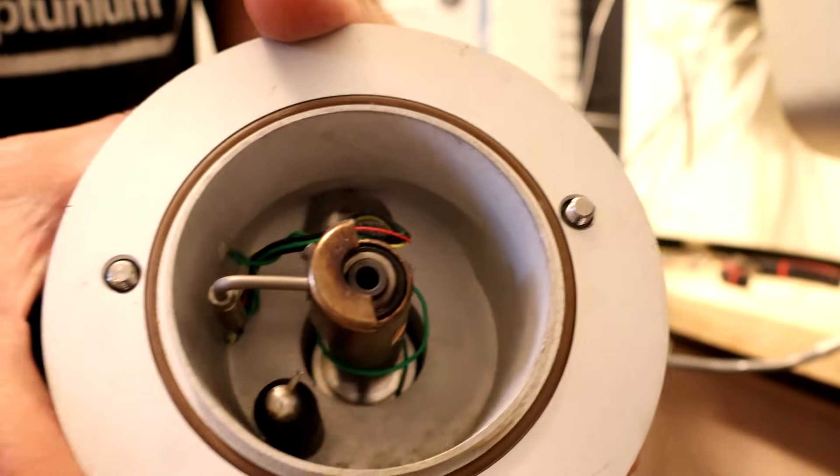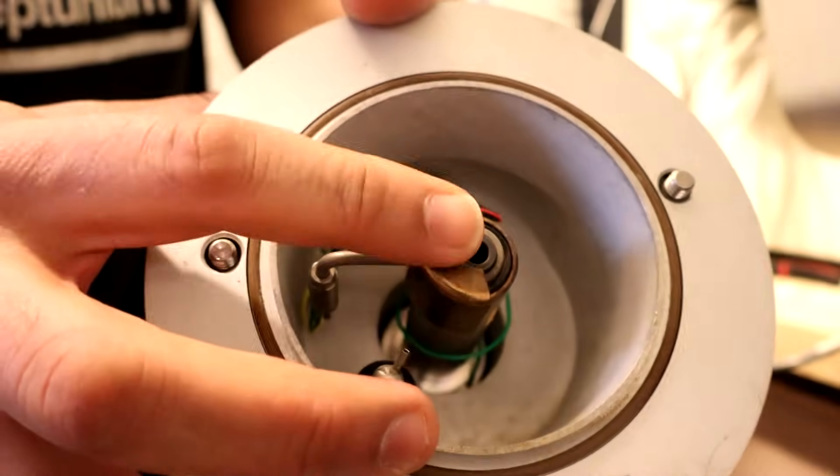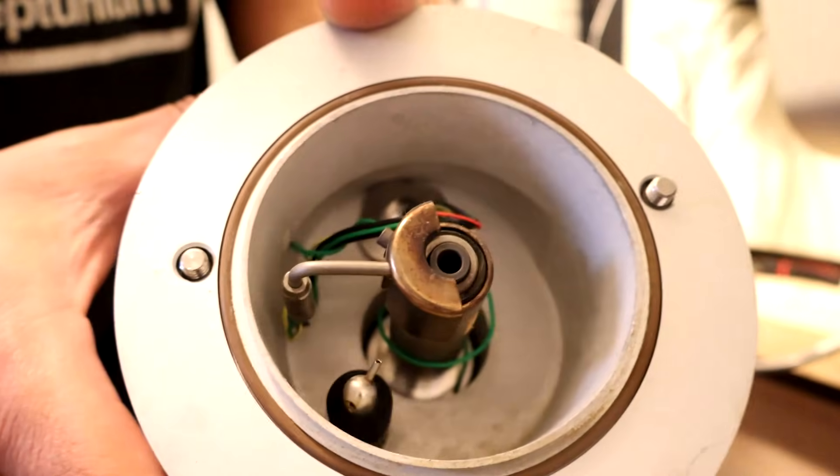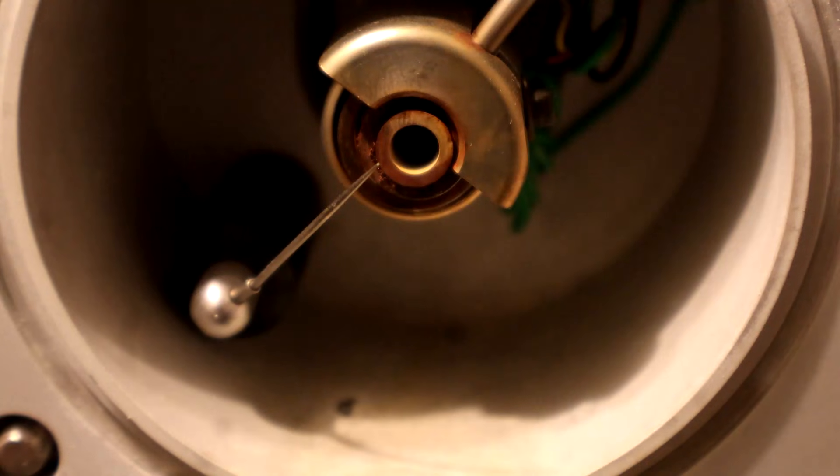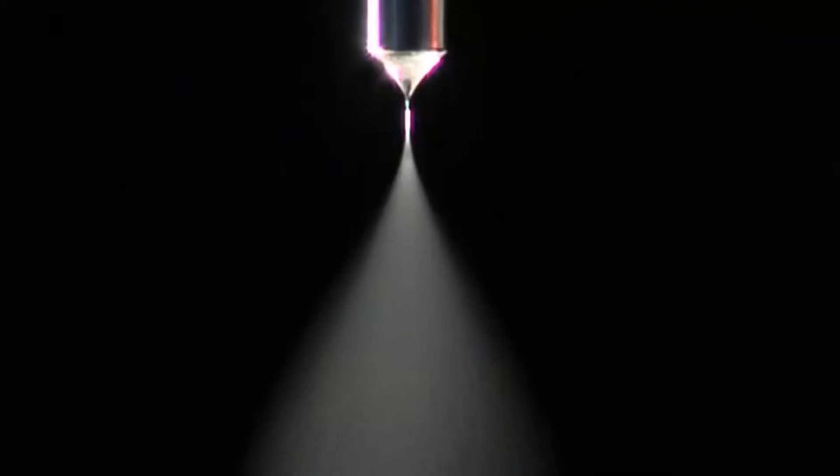In the APCI mode, the sample is sprayed inside this cavity here and heated to a few hundred degrees and then meets this needle held at a high voltage before being introduced in the instrument. In both cases, a constant stream of nitrogen is critical for a good even spray and to carry the ions to the entrance of the mass spec.